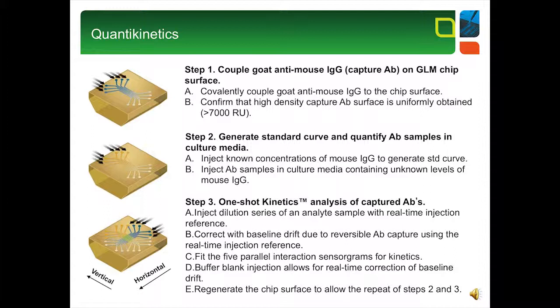So the first step is constructing the capture surface, and in the second step, we capture the antibody to the surface while quantifying these antibody samples. And the third step, we measure the kinetics between the antibodies and antigens. So this is the whole workflow of the Quantikinetics technique.